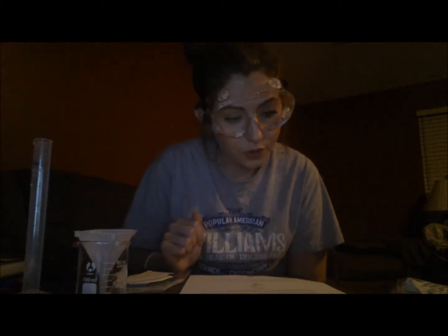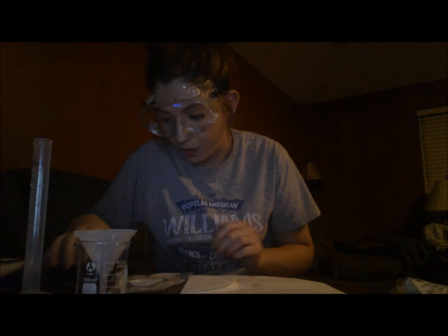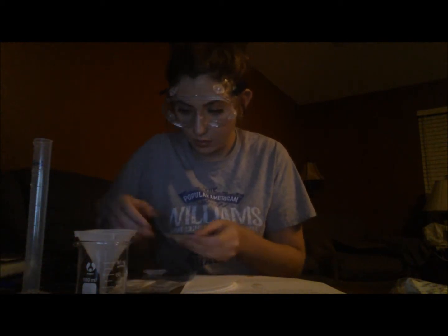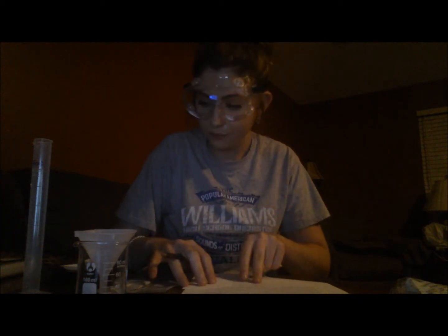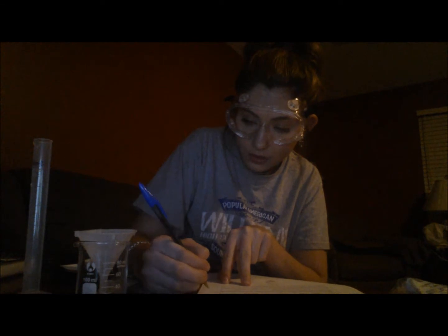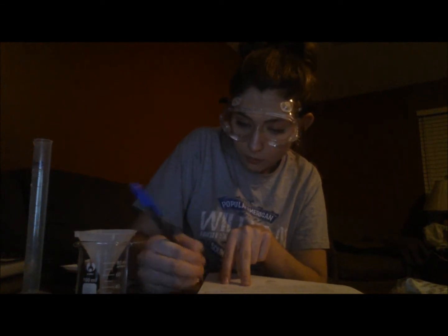So, first thing we're going to do, 1 gram of CaCl2. So, we're going to turn on our scale. Okay, I'm going to put the weigh boat on. That is 0.6, so I'm going to write that down. 0.6 weigh boat.